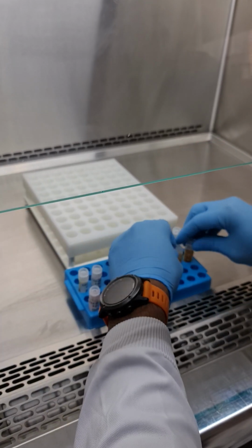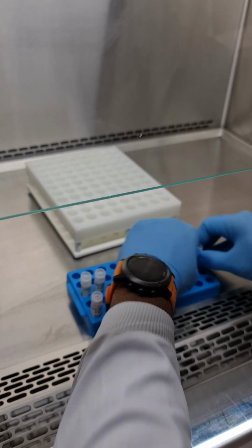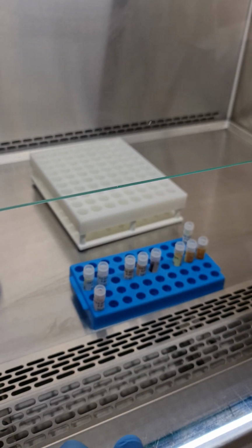Again, once done, close the tube and the sample is done, ready to go in the -80 freezer. Thank you.